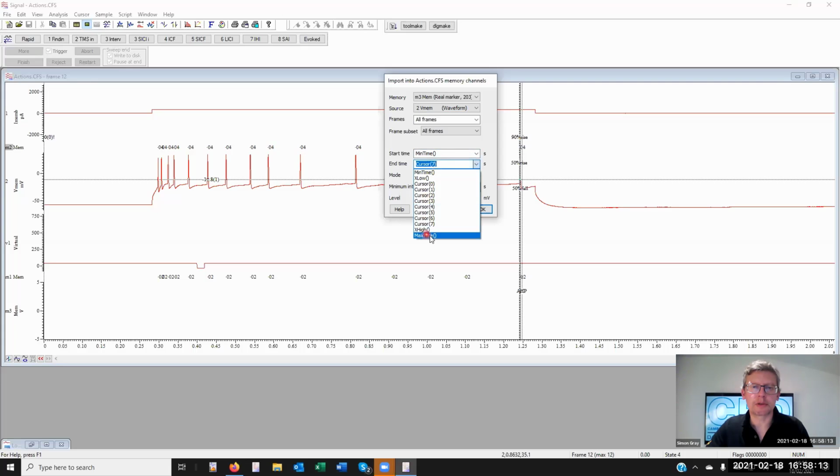And max times the whole sweep length, and the level peaks. Okay, so the size of the peaks must be, say, 20 units in this case. So looking for a local maximum, and then we must have a fall away from it of 20. And there's 0 for the minimum interval in my case.